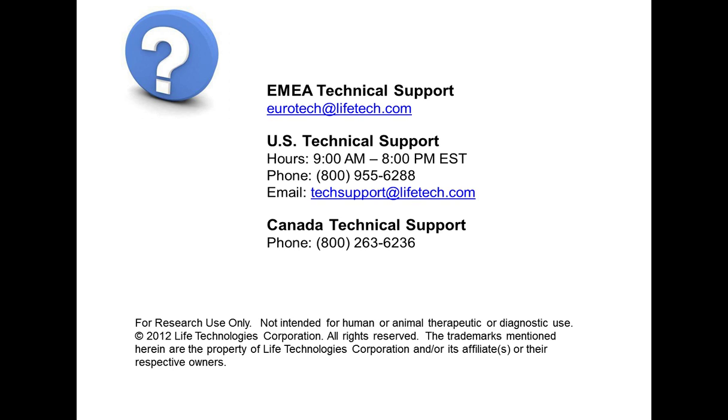So there's a question about setting the voltage and selecting the voltage that gives a higher fluorescence. Selecting the proper voltage for an experiment is one of the more difficult things in flow cytometry. My suggestion is that your positive signal, your control, needs to be on scale, and your negative signal also needs to be on scale at the other end. So when you're setting up your instrument, please look at both of those and try to make the best that you can there.